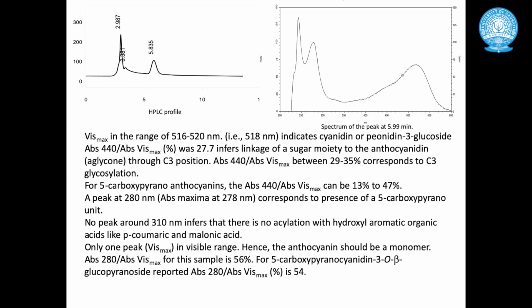So these background informations and some more informations about anthocyanins, which can be understood from their spectrophotometric profile, are given here.